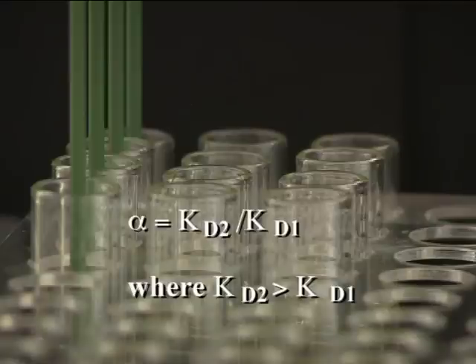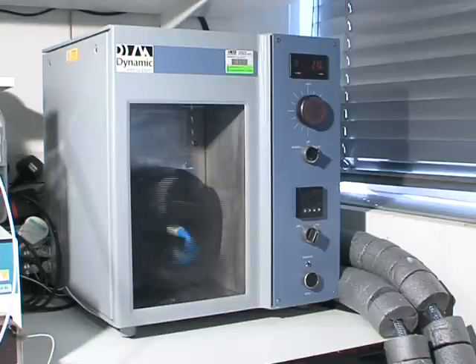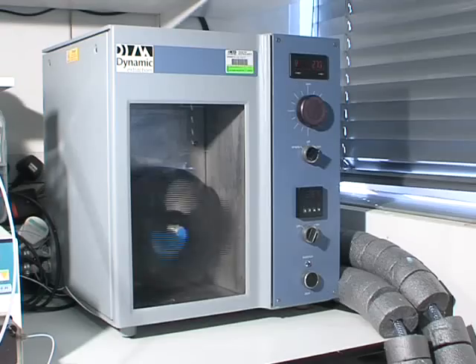Furthermore, once the performance of a particular countercurrent chromatography instrument under various run conditions has been observed, it's relatively easy to predict the minimum alpha value necessary for a given purification, helping in the selection of the best solvent system to use.